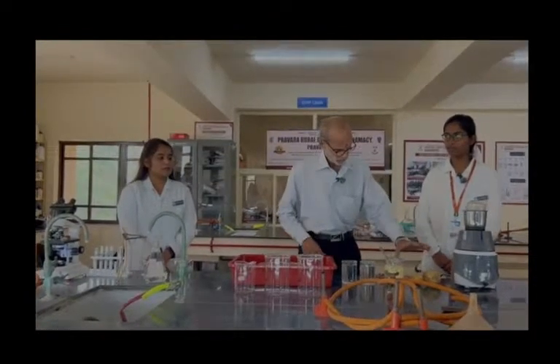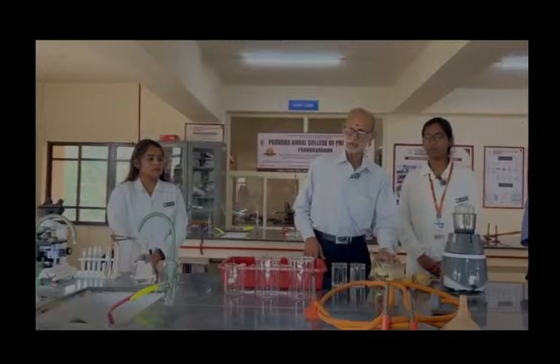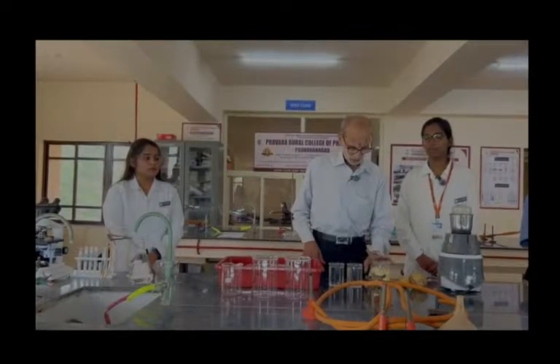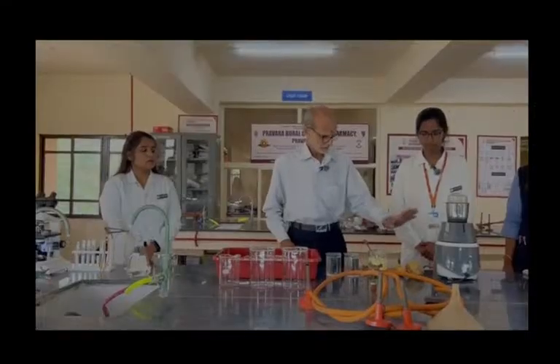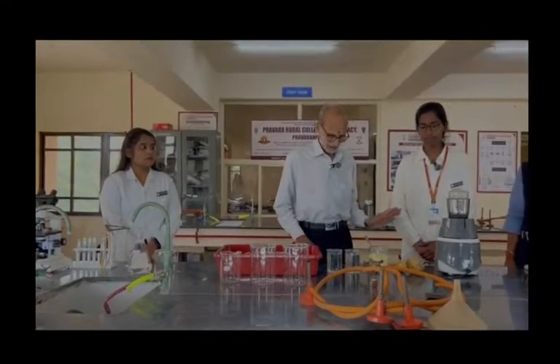And here we have a potato, and these are the peeled potato pieces. What we are going to do is make a pulp from it in a mixer. Bhakti is going to do that.